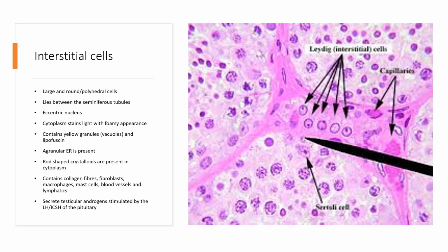The interstitial cells, from the name, are interstitial. They lie between, it finds itself between two things. It lies between two lobules, or two tubules. You find it standing at the middle point, communicating between two to three seminiferous tubules.